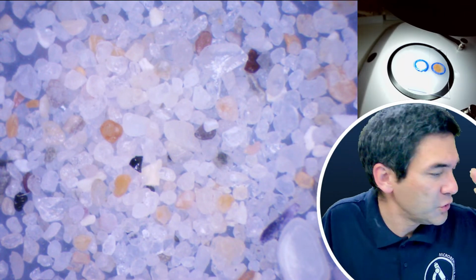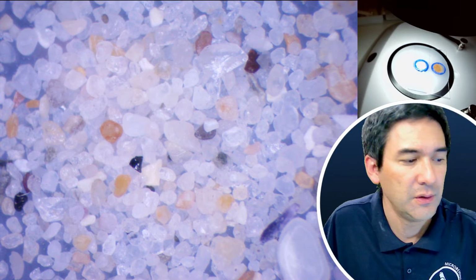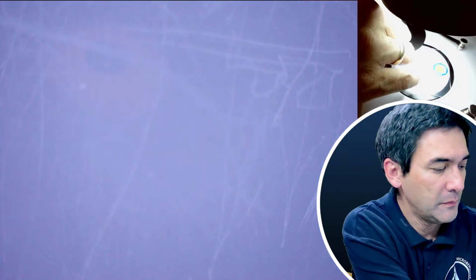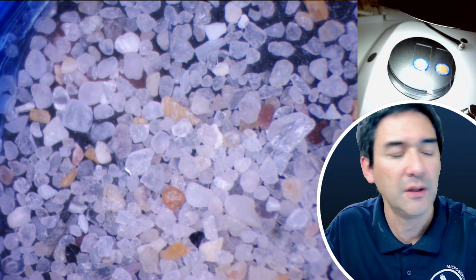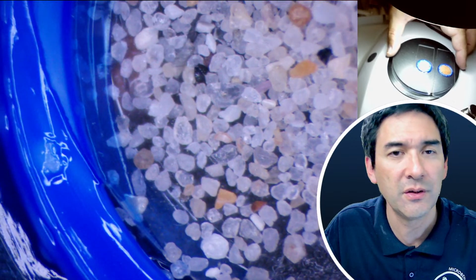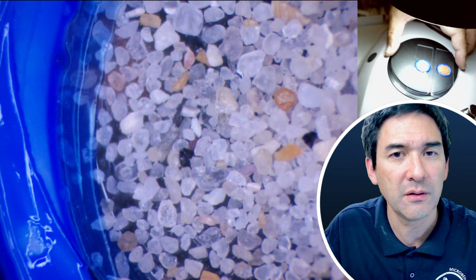Yeah, so I'm just realizing one thing, you know what? Why not try a darker background here? Okay, looks a little bit better. Better contrast. I mean, it looks pretty white. It looks maybe a lot of quartz. Yeah, sometimes it's, yeah.